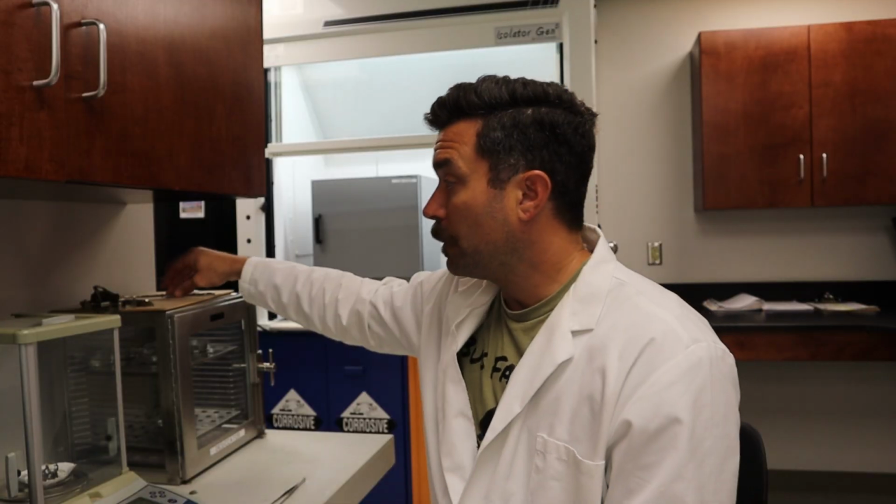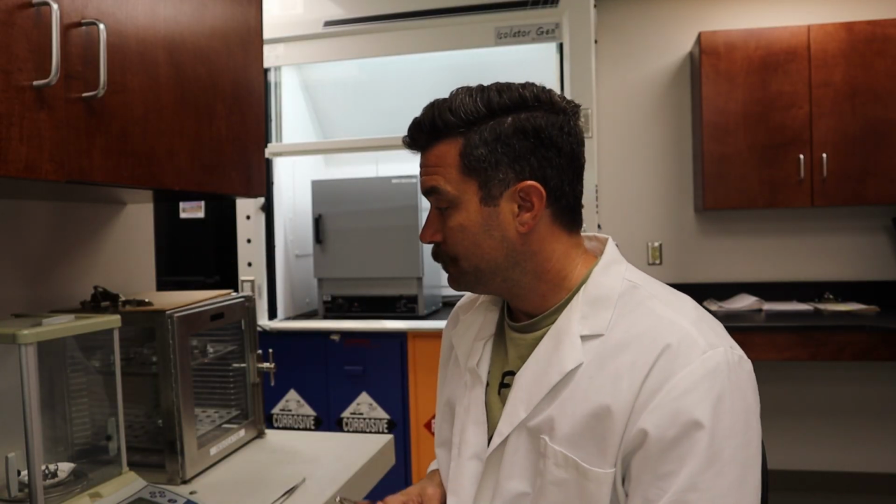But before we start that, first thing we want to do is remove this from the balance, and we want to put it inside our muffle furnace. 550 degrees Celsius for 15 minutes. It is going to burn off any organics that are left on that sample. And we will then require that ash weight after it's cooled in the desiccator for us to then be able to solve for the amount of organics that we actually have in the system. So let's do that now. We're going to remove it from the balance and go throw it in the oven. Excuse me, the furnace.